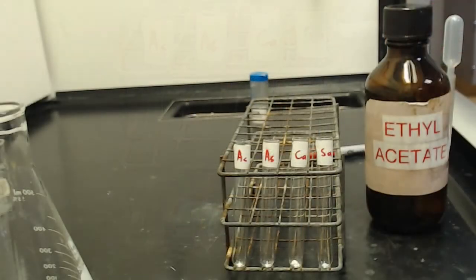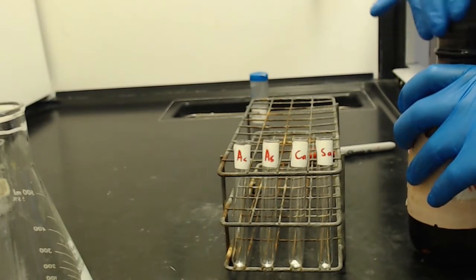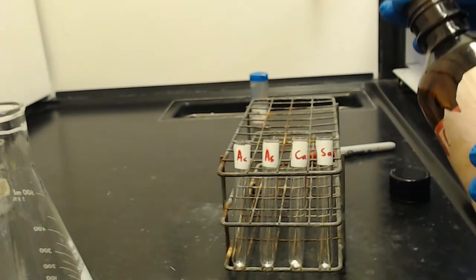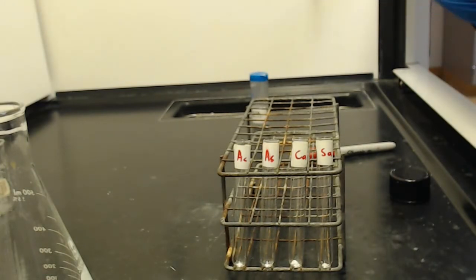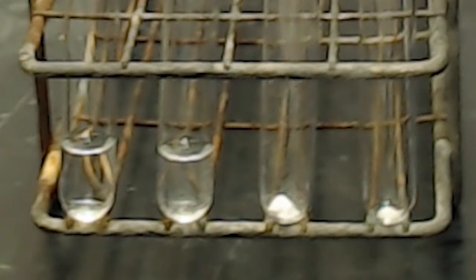I'm going to add about 1 or 2 mils of ethyl acetate. It doesn't need to be exact, just as long as they have some solvent in there. So I'm going to get a pipette full of ethyl acetate for each one of these. According to this pipette, it should be about, I'm thinking, 4 to 5 mils, quite a bit, so about half a squirt. Yeah, that looks good. I'm kind of eyeballing it here, guys. It does not need to be exact.